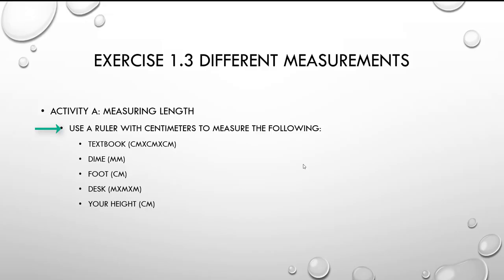It could be a small ruler that maybe you had in high school or whatever. You have an OpenStax textbook, which is an online textbook, but just grab any book. It doesn't have to be a textbook or a biology book. It could be anything. And you're just practicing measuring it. So you want the length, the width, and the depth of it, all in centimeters. You're just practicing measuring things with the centimeter side of it.